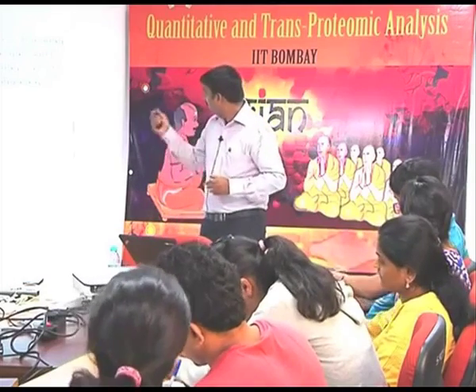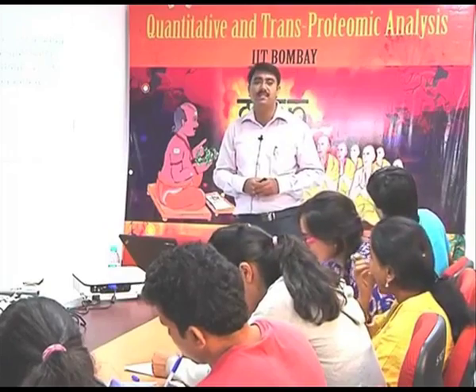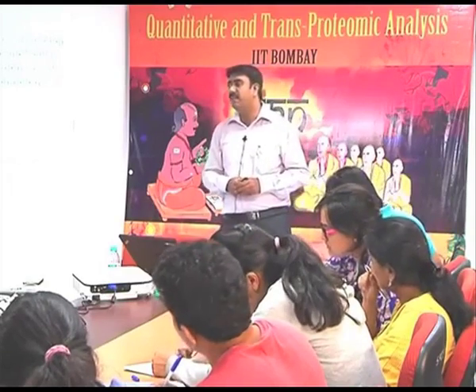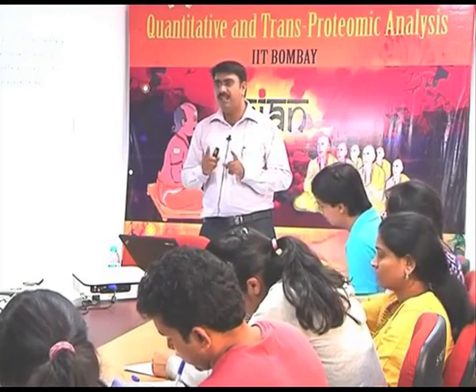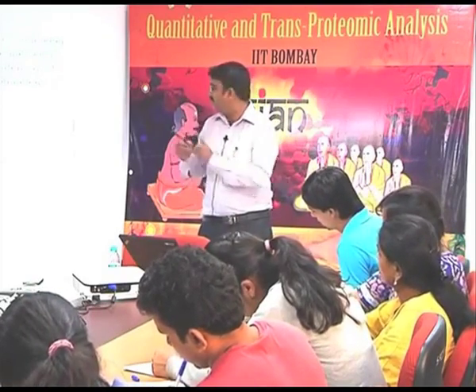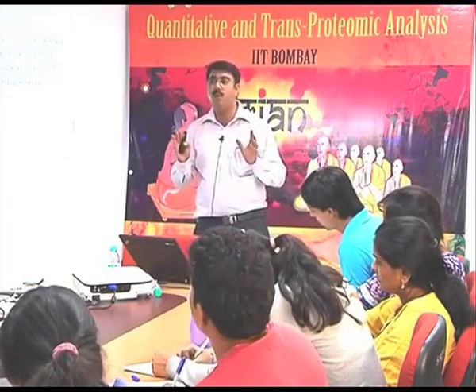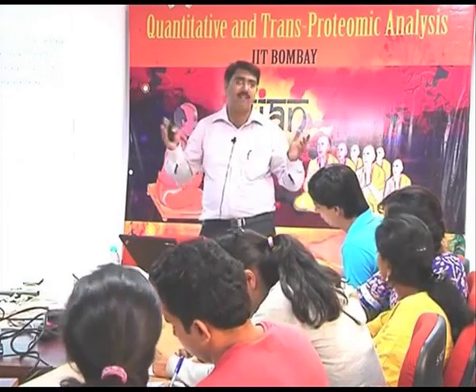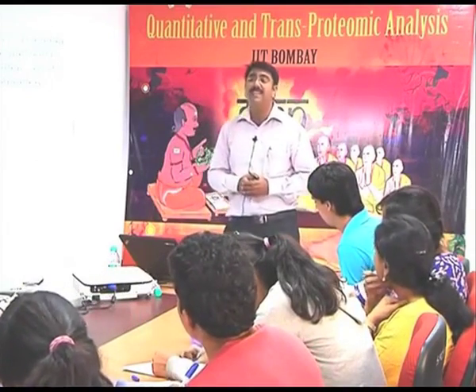Okay, I am going to discuss what exactly this BLI technology is. BLI is nothing but BioLayer Interferometry. SPR technology is surface plasmon resonance. Here we have the BLI technology. The technologies are different, but the output from SPR or from BLI is the same. So how exactly does this technology work?